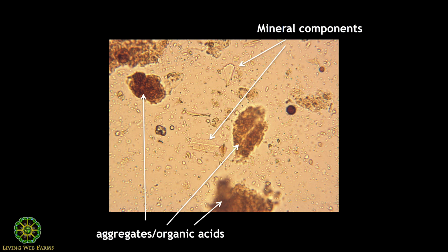One of the things I didn't mention about that group of protozoa I was talking about, the flagellates, the ciliates, and the amoeba: the ciliates are kind of like here and there, no problem, but if you see huge amounts of them, it means you're heading anaerobic. So other clues in a really anaerobic situation: if you see a bunch of little critters moving around really fast and you wonder if those are ciliates, and you're not sure because you can't see their little cilia or you're just starting out, well, do you also not see a bunch of aggregation? Do you also see a bunch of lactobacilli, which is an anaerobic bacteria that's really long and skinny? So all these context clues, the living and the non-living, come together to give you a picture and help you understand what's going on in your soil.